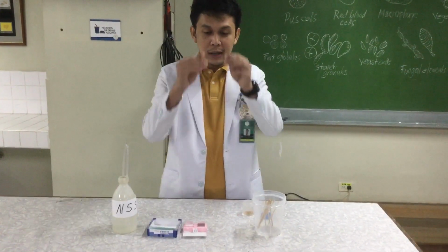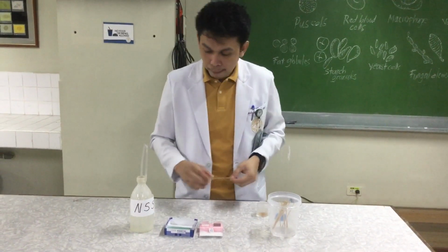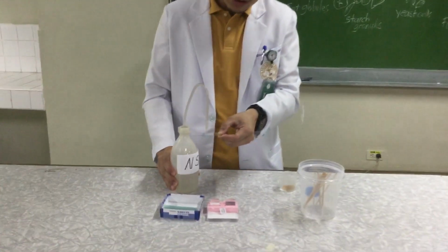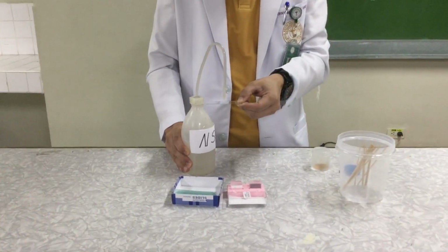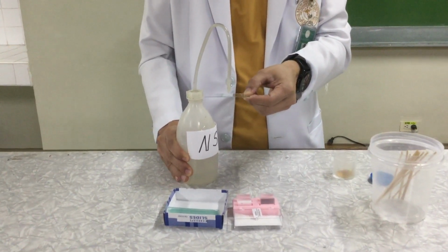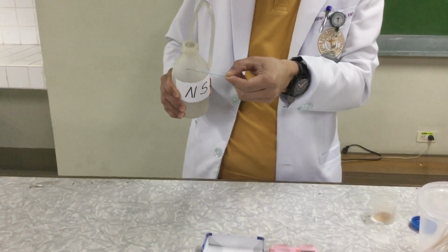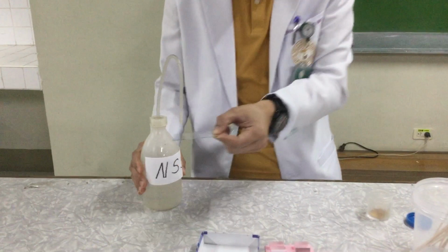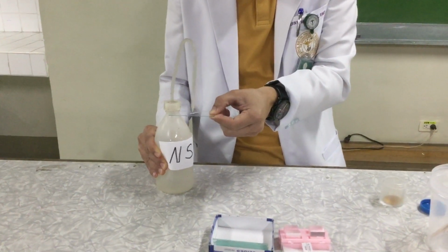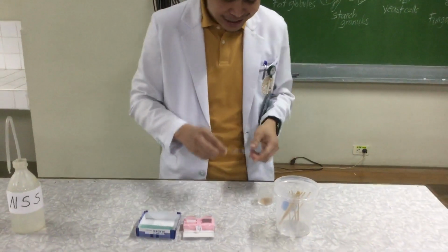Of course, again, you need a clean slide. And then, get a drop, a minute amount of NSS. Wow, ang tigas. Ayaw naman eh. Okay, just a little NSS like that.